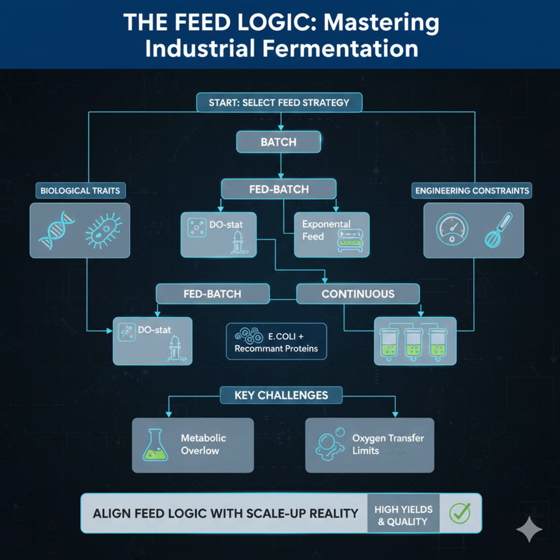It's suitable if the product is purely growth-associated, and most importantly, if the overflow is either benign or actually desired. Think about high-sugar anaerobic fermentations for bulk products like beer or lactic acid. You want that initial high substrate load to push rapid fermentative metabolism.